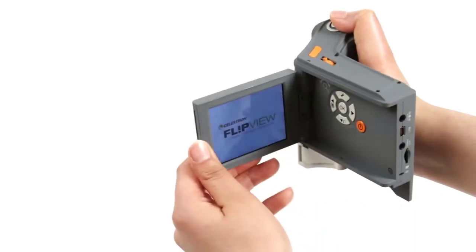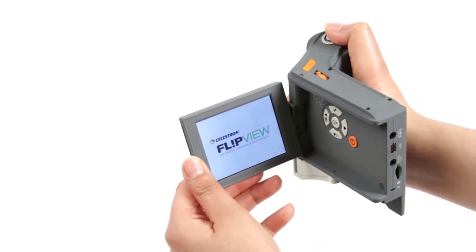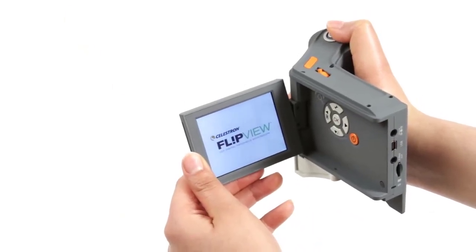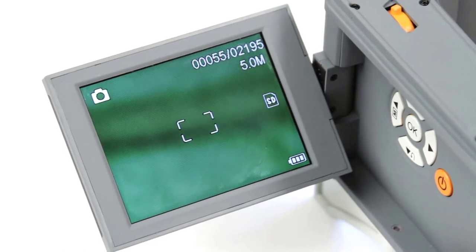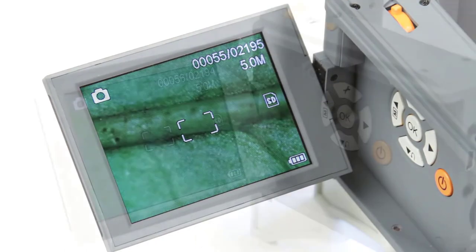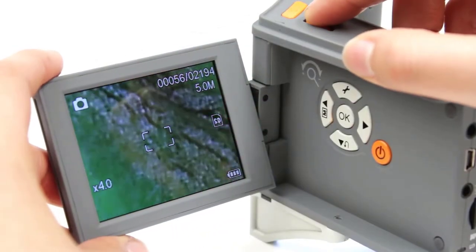The flip view looks very similar to a camcorder, and can record still images on a micro SD memory card, and can capture 1080p HD video too. This makes this a great learning tool, and allows you to easily collect illustrations for scientific projects.